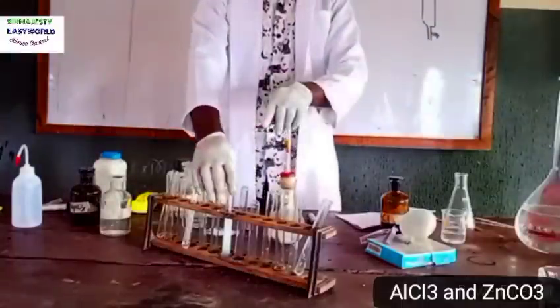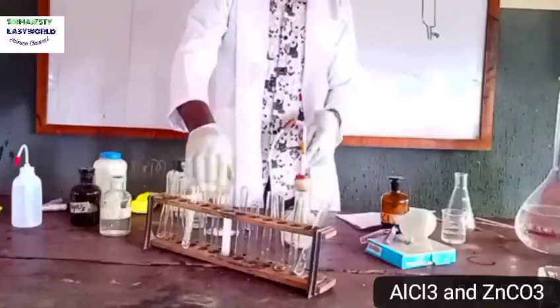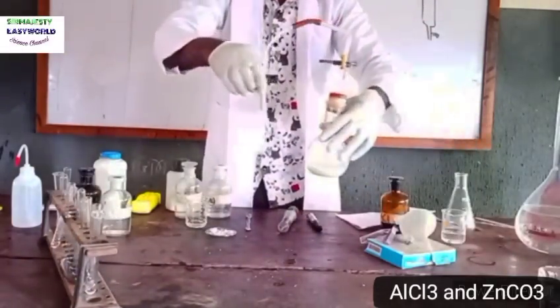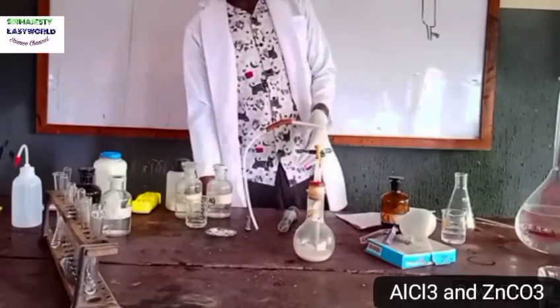Okay. So that's the chemistry. So the gas which turns lime water milky is actually CO2. So this is just extra. You see, it's possible, not just to report that colorless, odorless gas evolved and it turned lime water milky, you can now see that it is quite possible that a gas that is coming out will turn lime water milky.